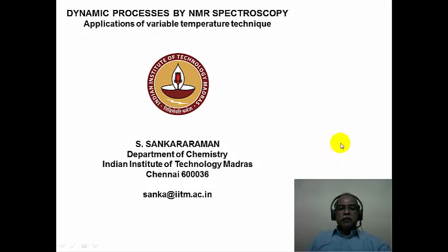Hello everyone, welcome to module 13 of the course on application of spectroscopic methods and molecular structure determination. In this module, we will see some aspects of the variable temperature NMR technique and how to study dynamic processes in molecule by NMR spectroscopy at various temperatures.